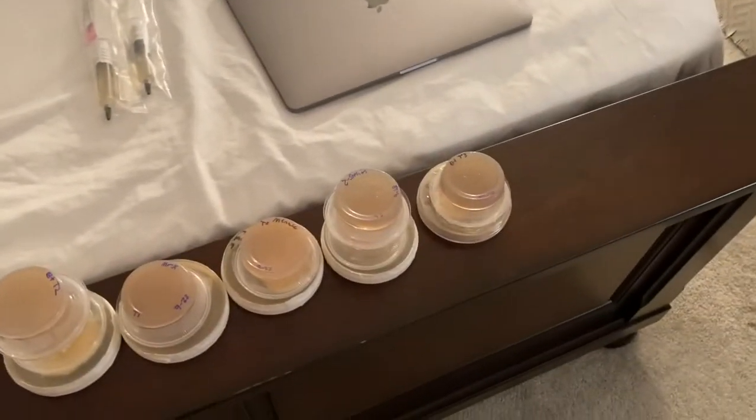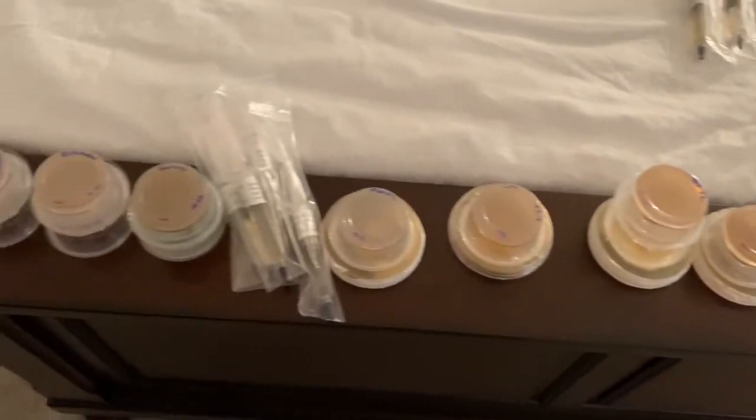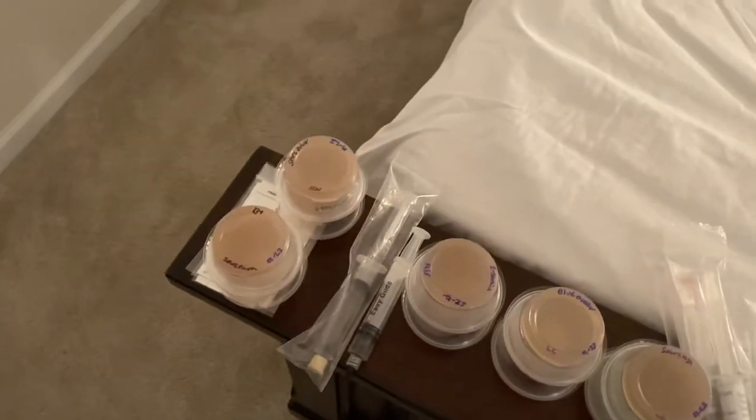So I'll start off with culture to culture transfer, like agar to agar, and then I'll move to liquid culture to agar, and then I'll move to multi-spore syringe to agar, and then I'll move to spore print to agar.